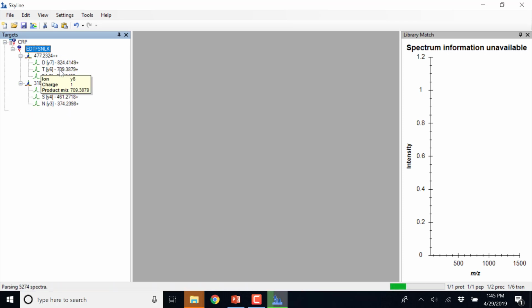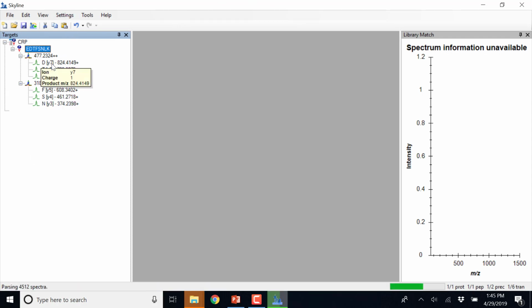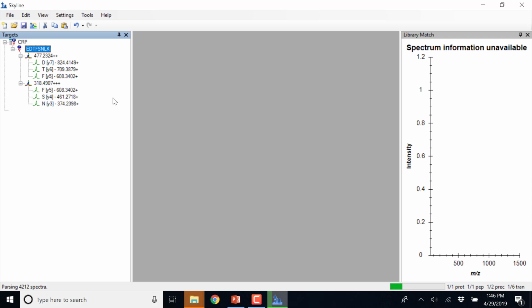So anyway, you can choose. Right now, Skyline has been set up to pick the product ions based on the information that are default given into it. So at some point, we might have said in here that pick the 3 best product ions that all have a mass to charge greater than the precursor. Now, does anyone know why we look for high mass to charge product ions?